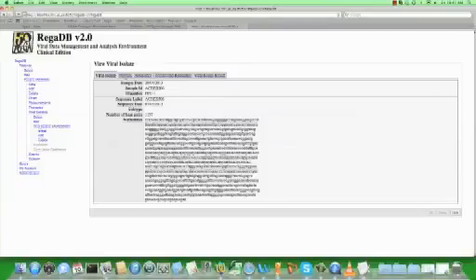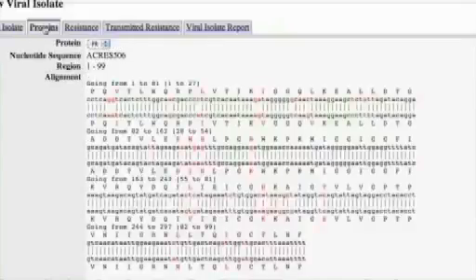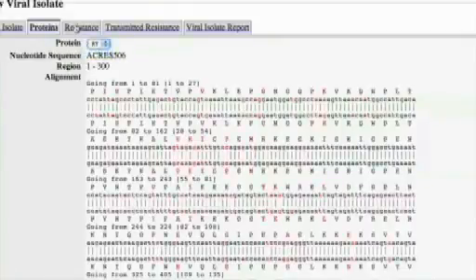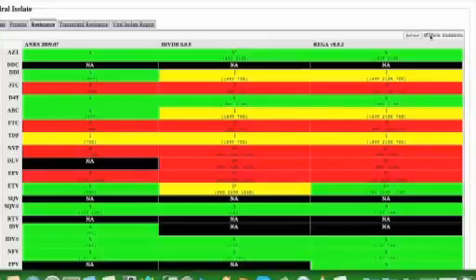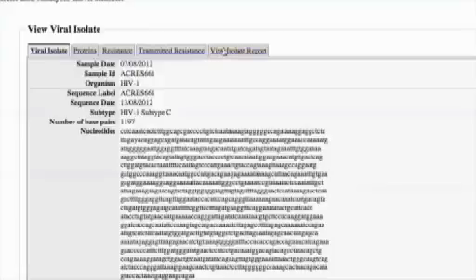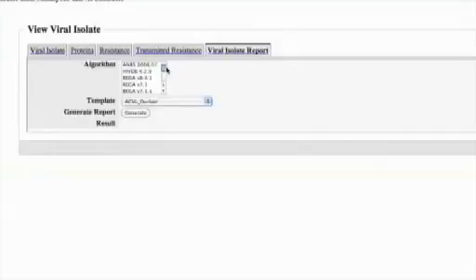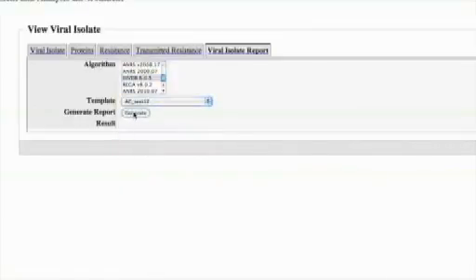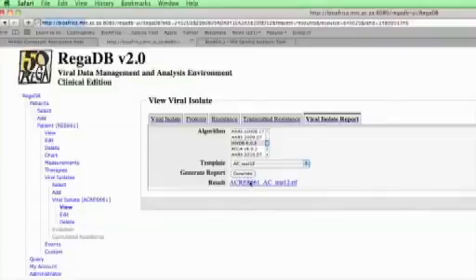Check for protease and RT protein alignments by clicking on protein and selecting either PR or RT. Check for the drug resistance mutations using the resistance button. This gives you the resistance profiles from three algorithms: ANRS, Stanford HIVdb and RegaDB. Click on the viral isolate report tab. Select the algorithms for the interpretation of the genotype and the report template to use. Once the algorithm and the template are selected, click on generate.